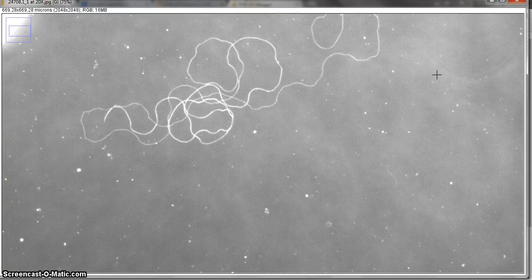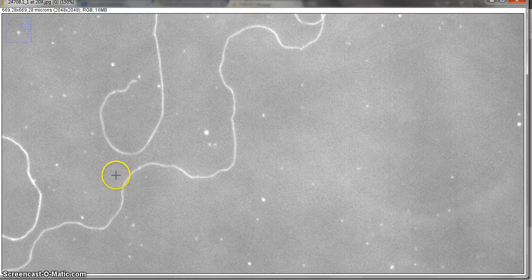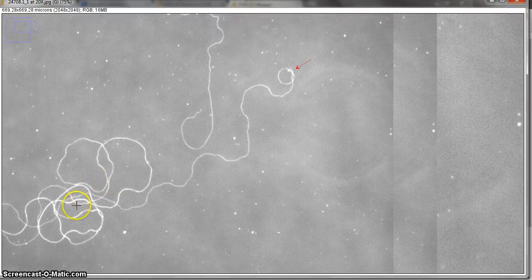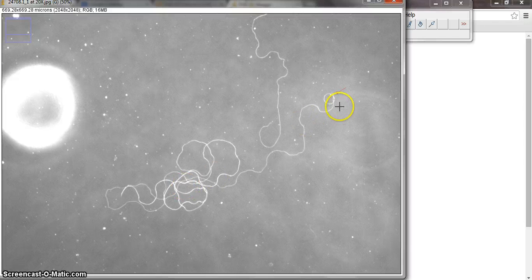Then I hit the key that has an equal and a plus sign on it to zoom in, and where my mouse is, that becomes the center. In order to zoom out, I hit the key with the minus and the underscore. So imagine minus means that you're zooming out, plus means that you're zooming in. Okay, so now I'm zooming out. And again, wherever my mouse happens to be, that will become the center, more or less, of what you're zooming in or out of.